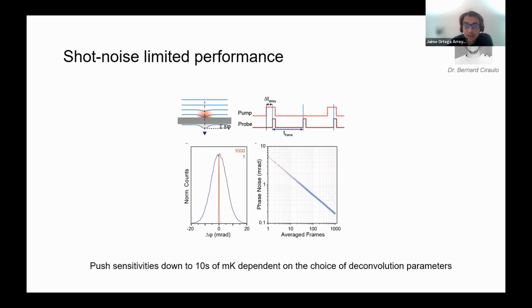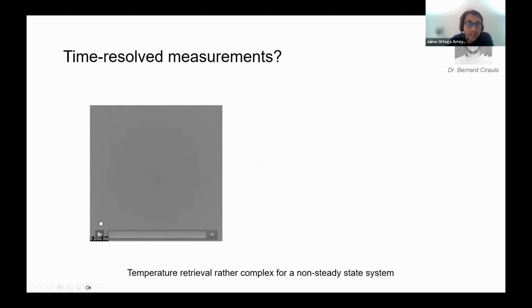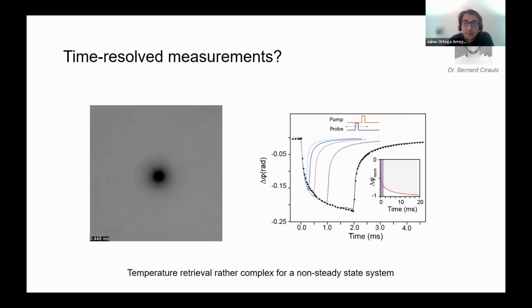So we got really excited. And so the next thing is like, well, can we resolve temperature dynamics? And from a hardware perspective, since you have a pump-probe system, you can just scan your probe relative to the pump, and you can get time-resolved information. This is very similar to the work that Naomi Ginsberg already presented earlier on in this webinar series. And so the main challenge here was that, going from phase to temperature, we relied on a model that required the assumption of steady state. And this is where things got complicated because we can no longer use this model. And if we wanted to find another analytical solution, the whole complexity started to add up in terms of computing and doing the temperature retrieval.